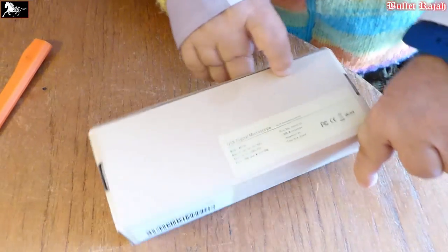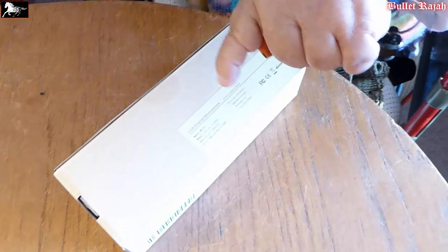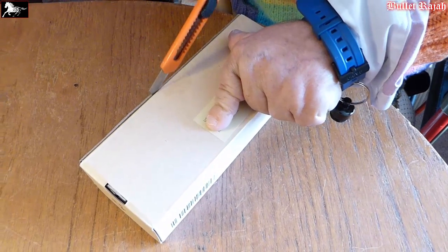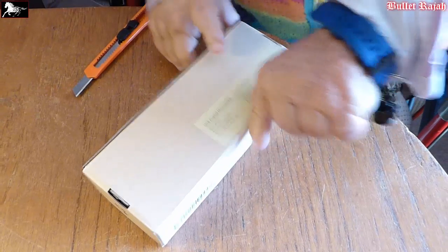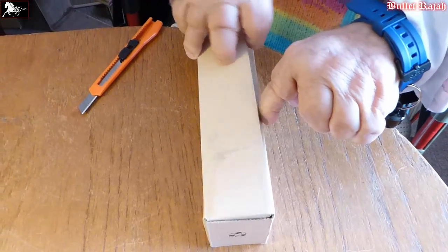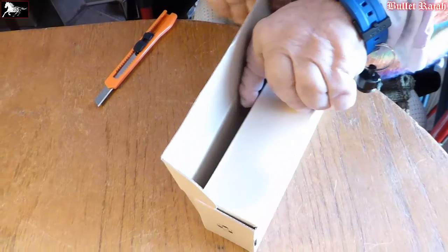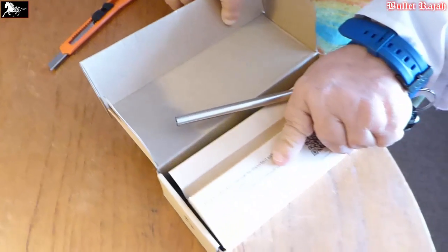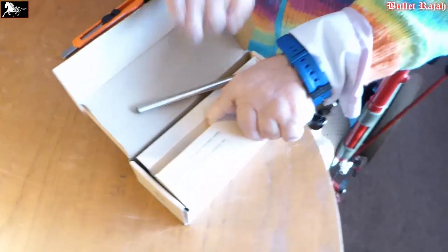Let's have a little flip and give it an open and see what we've got inside. What a neat piece of kit this is.